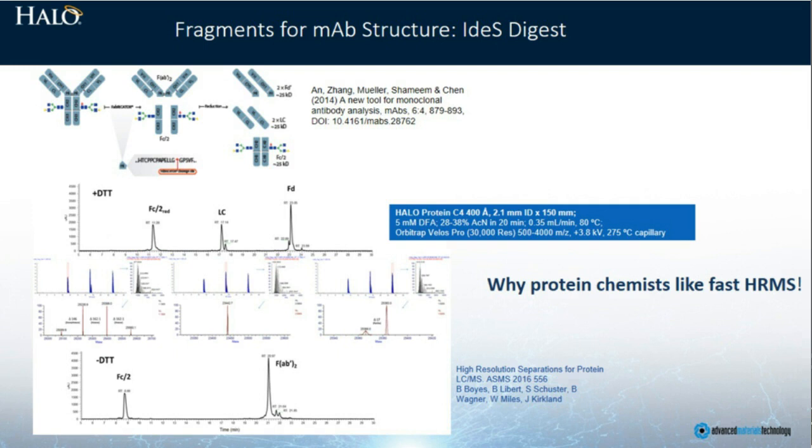Of course, this requires online mass spectrometry to get really useful and informative information. That's shown in the middle part of the diagram on the left side of this slide. Now, in this case, we are actually using a slightly different modifier of the mobile phase. We'll talk about that in a little while, which is difluoroacetic acid instead of trifluoroacetic acid. And we use that quite a lot for intact protein separations.